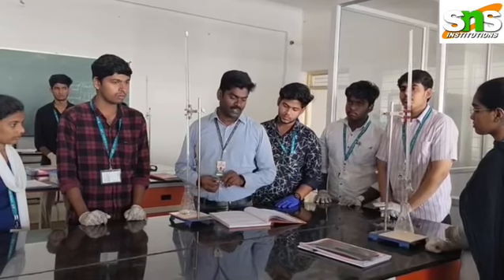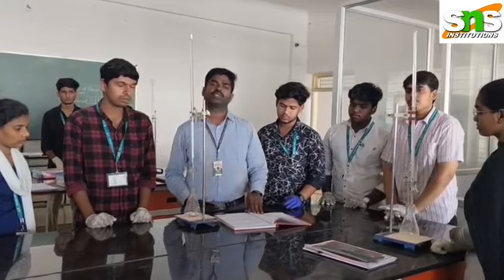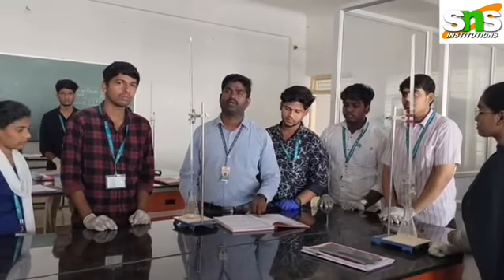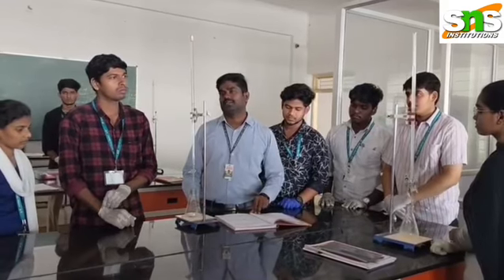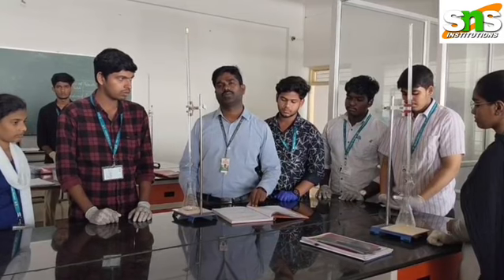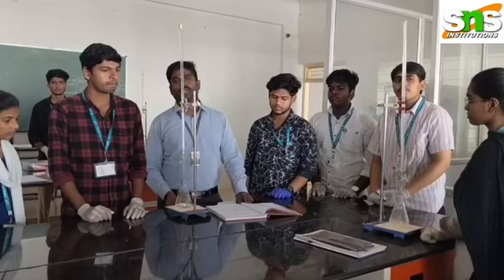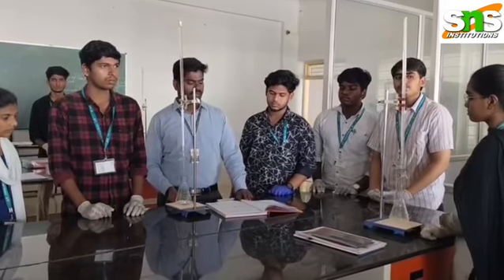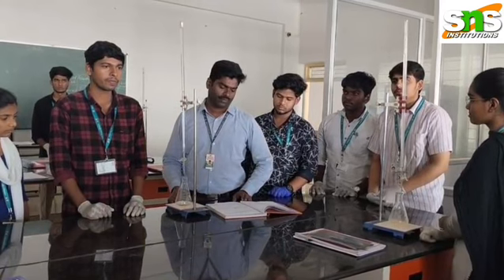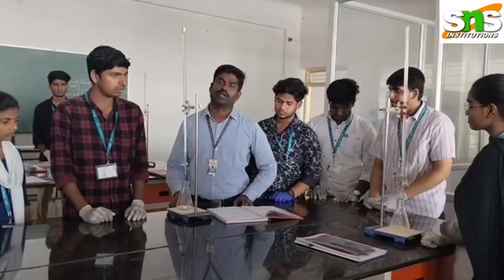We measured 2.65 gram of sodium carbonate, previously dried, and transferred it into a 250 ml volumetric flask. We added a little distilled water, dissolved it properly, and finally the volume was made up with distilled water up to the mark. I mean, we dissolved the sodium carbonate in 250 ml of distilled water.